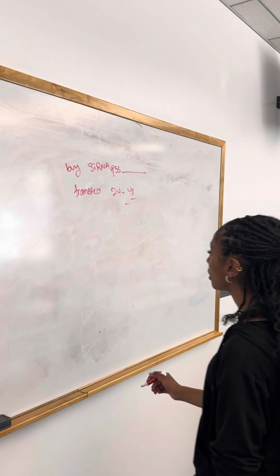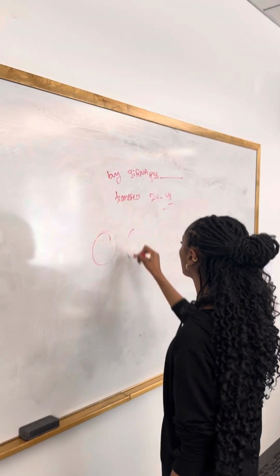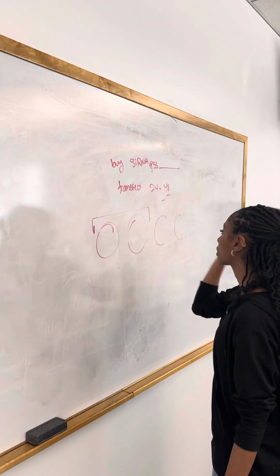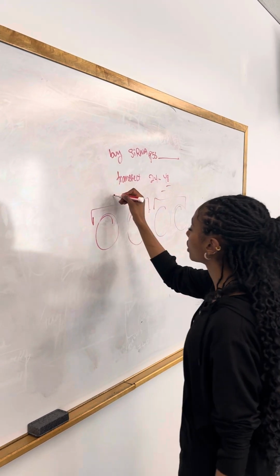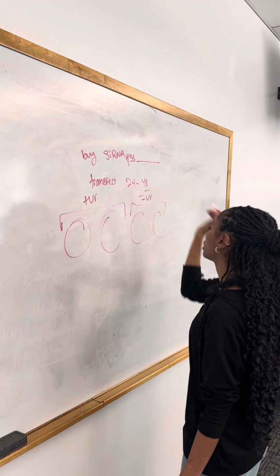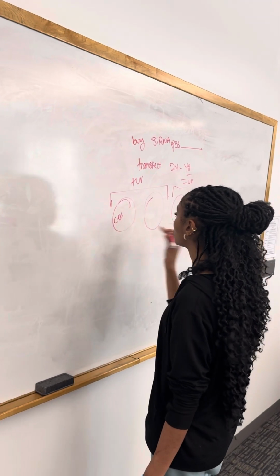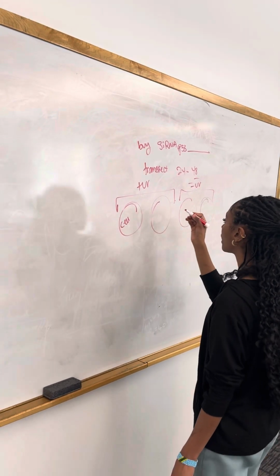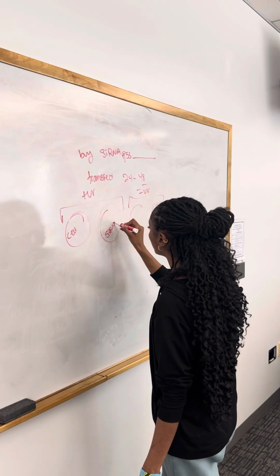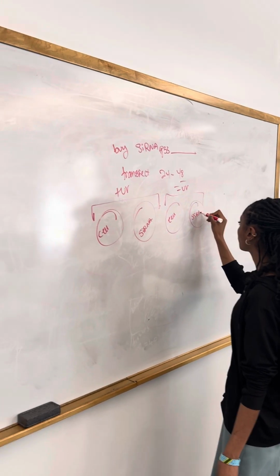After we wait, what are we gonna transfect it to? We're gonna have 4 cells. So the first 2 cells are gonna be UV damaged, and then these guys are gonna be not UV damaged. So this is gonna be our control, basically just the cell by itself. And then we'll add siRNA to it. This is gonna be cell by itself, and this is siRNA added to it.